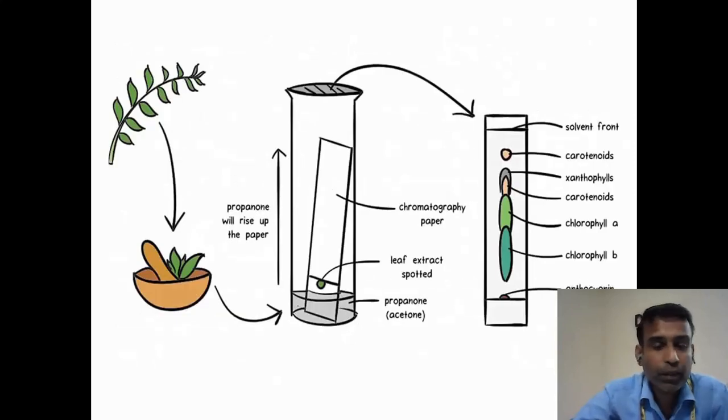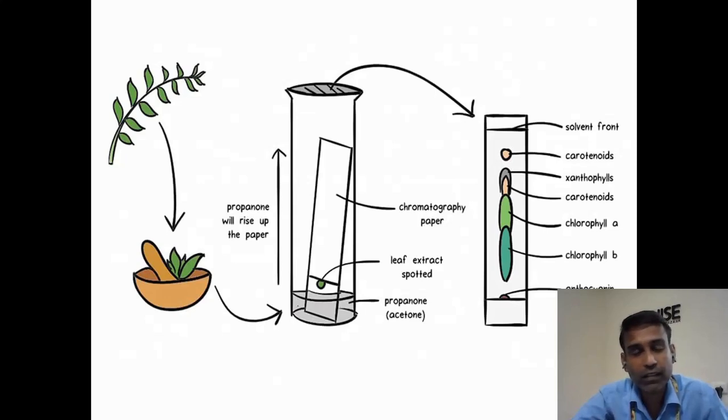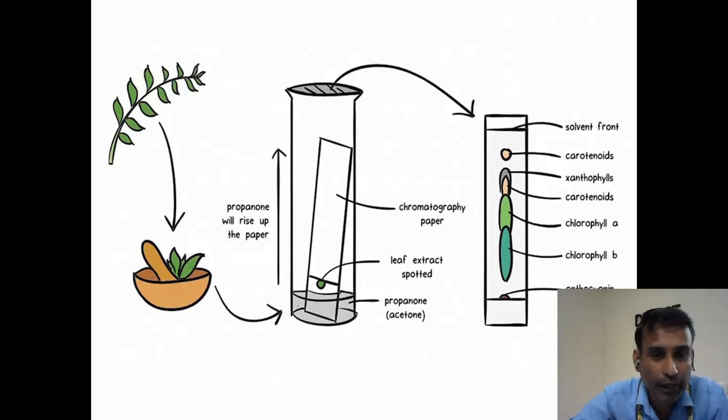So this is the general pictorial representation of thin layer chromatography or paper chromatography. In the early stages, they extracted the molecules from the plant materials. The plant is harvested and ground into small pieces, and mixed along with the solvent, so the plant material is dissolved in the solvent, and the solvent is transferred to the beaker.